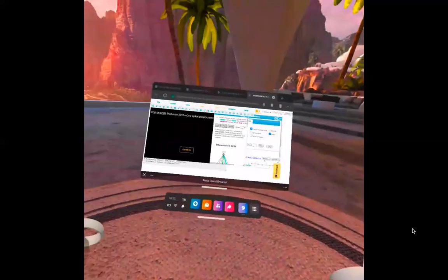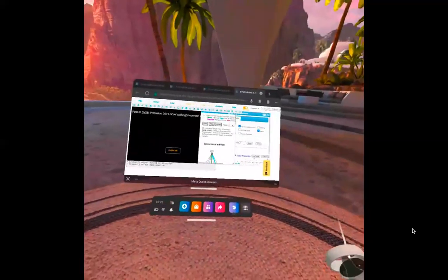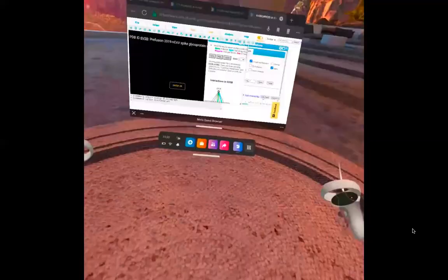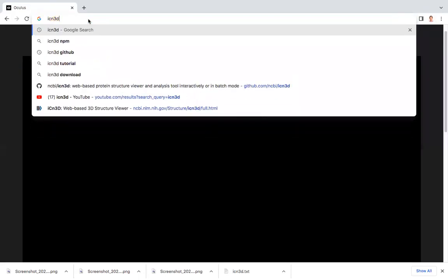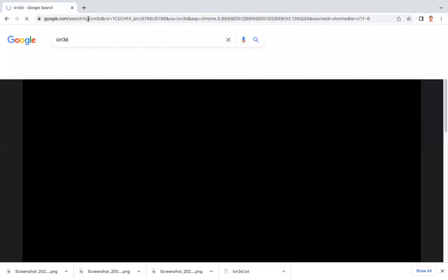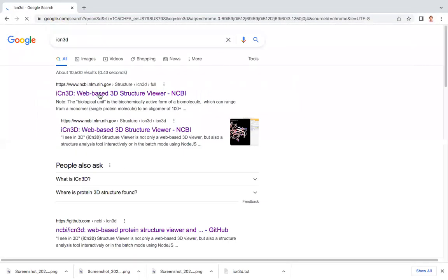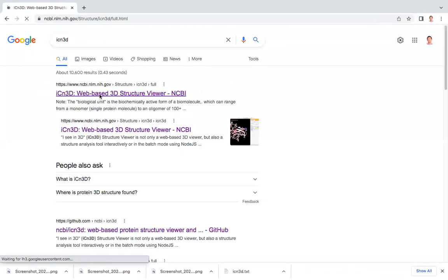Next, I'm going to talk about augmented reality AR. For AR, you're going to need to have an Android phone and use the Chrome browser. Let's assume you are in the Chrome browser in your Android phone. And again, you open iCN3D.